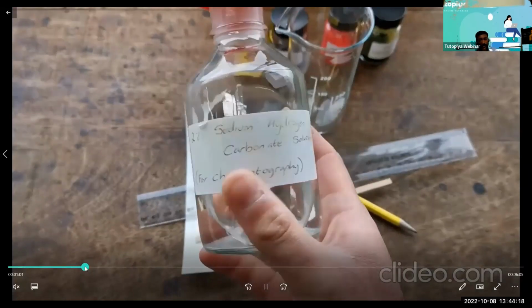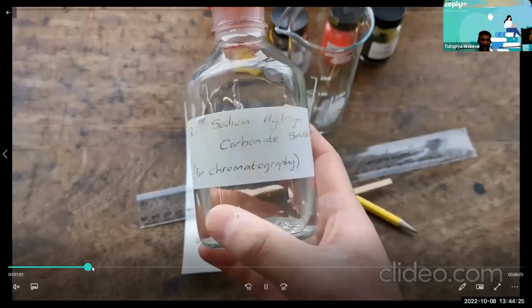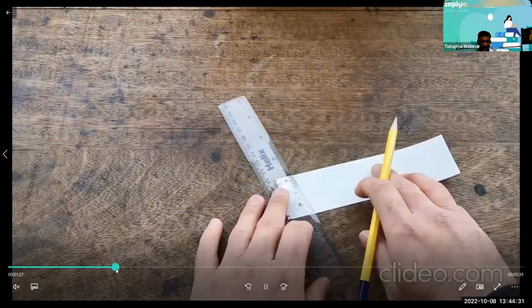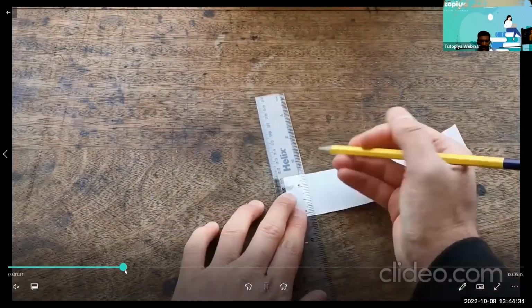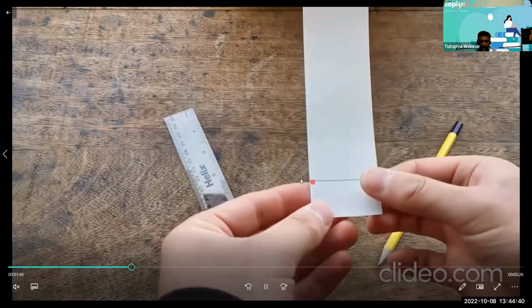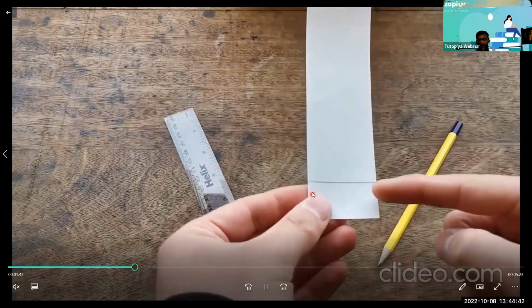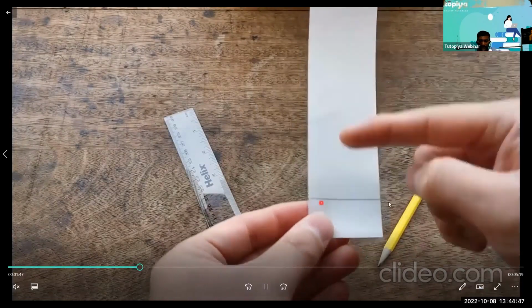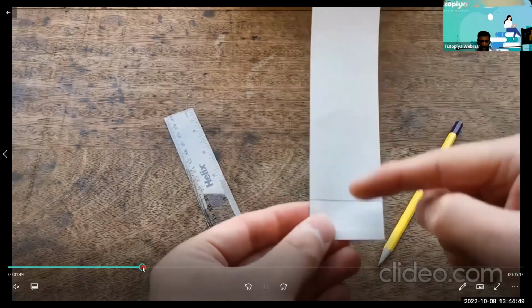I told you, you can even take water, but here the mobile phase is sodium hydrogen carbonate. And these are the capillary tubes just to take the solutes. Now I take my tissue paper or the chromatography paper. I draw a line about 2 centimeters above the bottom. It's a pencil, you need not take a marker, because I'm going to use different solutes to test. So this is just a pencil line about 2 centimeters from the bottom.